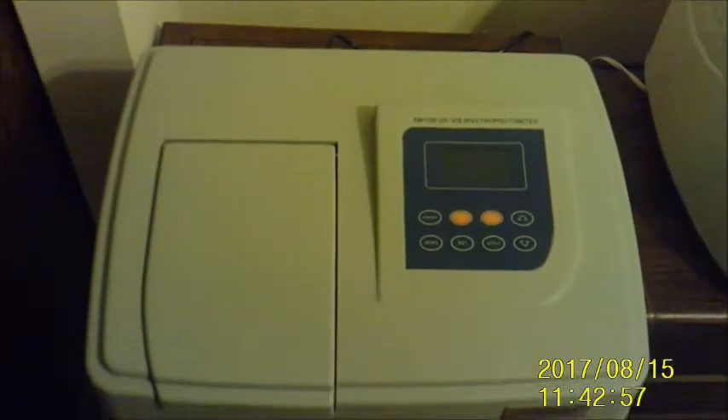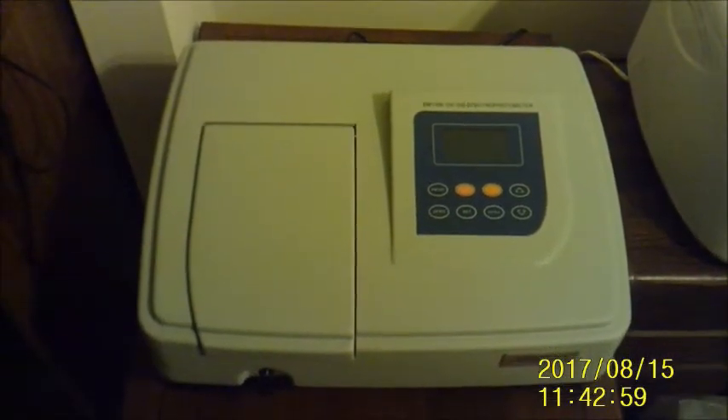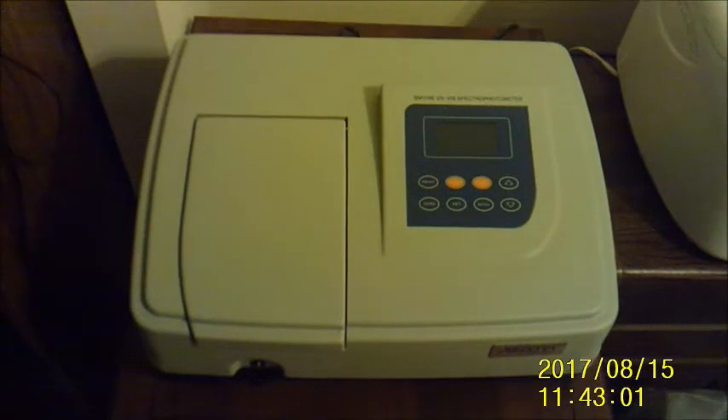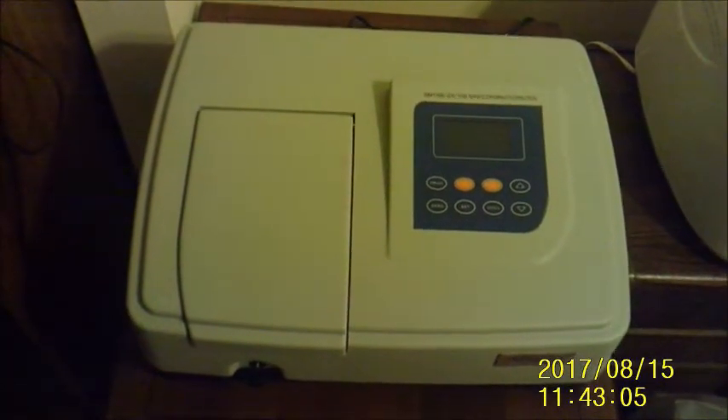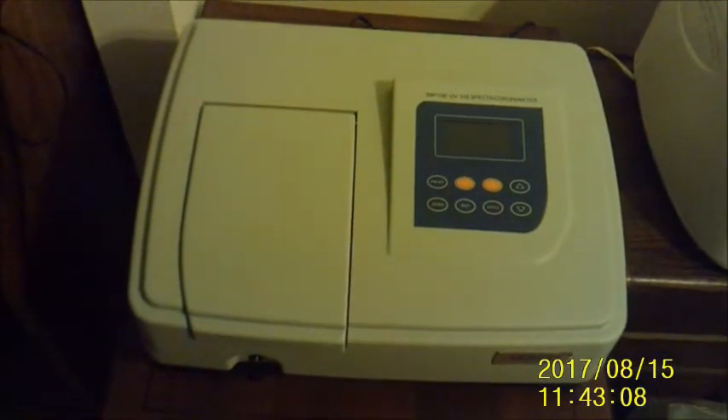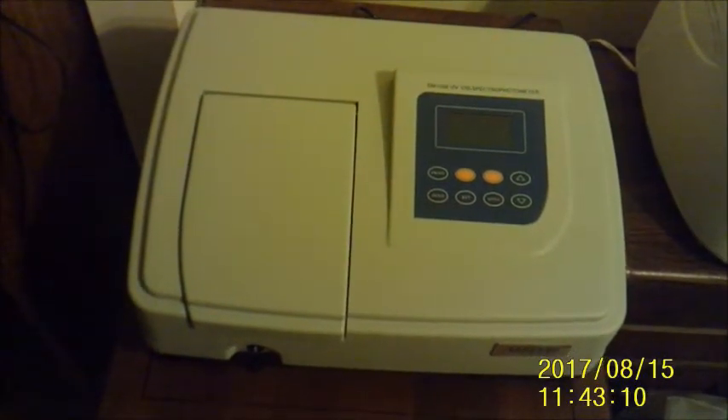This one is the Spectromaster 1100 UV/visible spectrophotometer. It has a wavelength range of 200 to 1,000 nanometers, which is slightly smaller than the range of the last one, but it will be good enough for my purposes. It comes with software; however, I have yet to be able to get the software program to work.